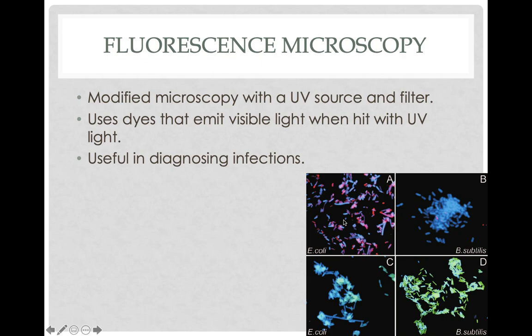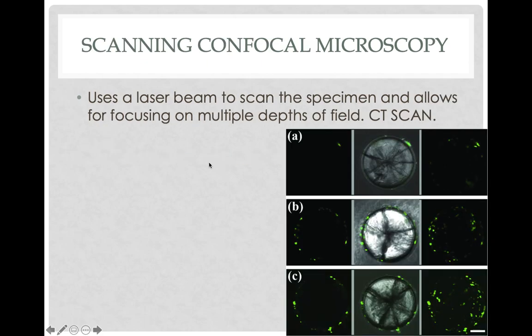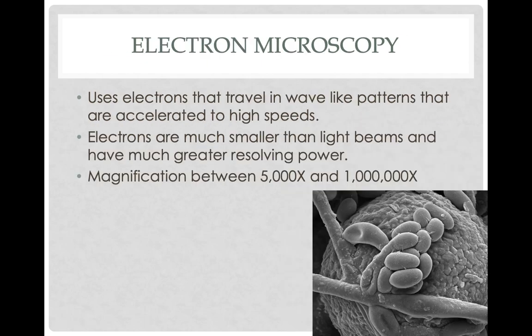You can see you got E. coli in the water sample. Pretty neat. Works a lot of the same kind of way when you're looking for bacteria in a body tissue and things like that. You can do it for lung tissue and things like that. I'm not going to talk about this one too very much.